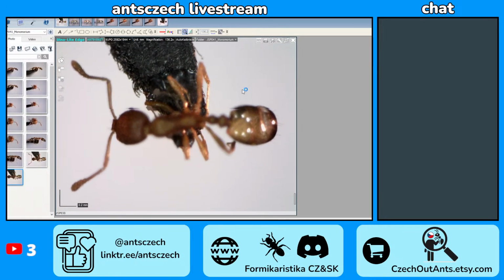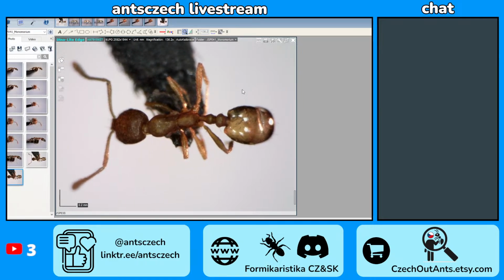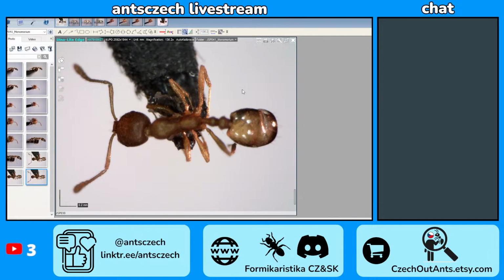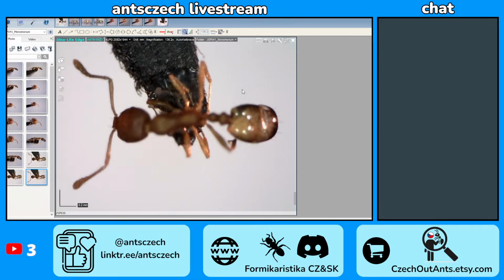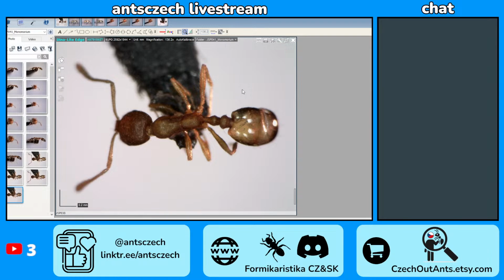Interesting frontal lobe. It's also nice that this app can do some basic focus stacking, so I don't have to take the pictures out and do it in another program.